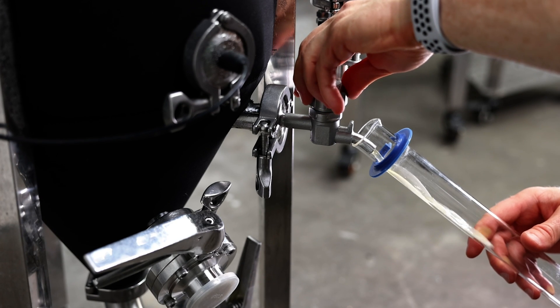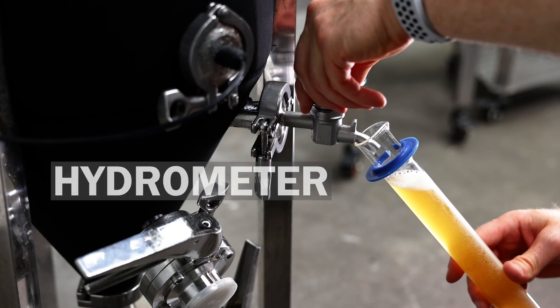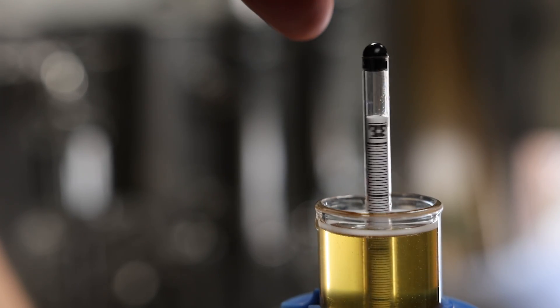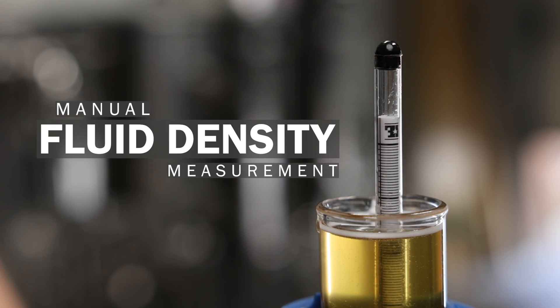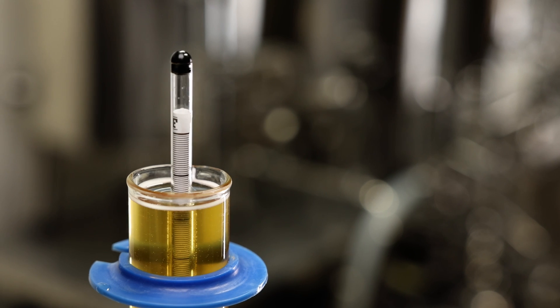Up until now, homebrewers typically used a measuring tool called a hydrometer to approximate the alcohol content of their homebrew beer. What people might not know is this only provides an approximation of the actual alcohol volume. The hydrometer measures the density of fluid, which can then be used with a simple calculation to get a rough estimate of the alcohol content.